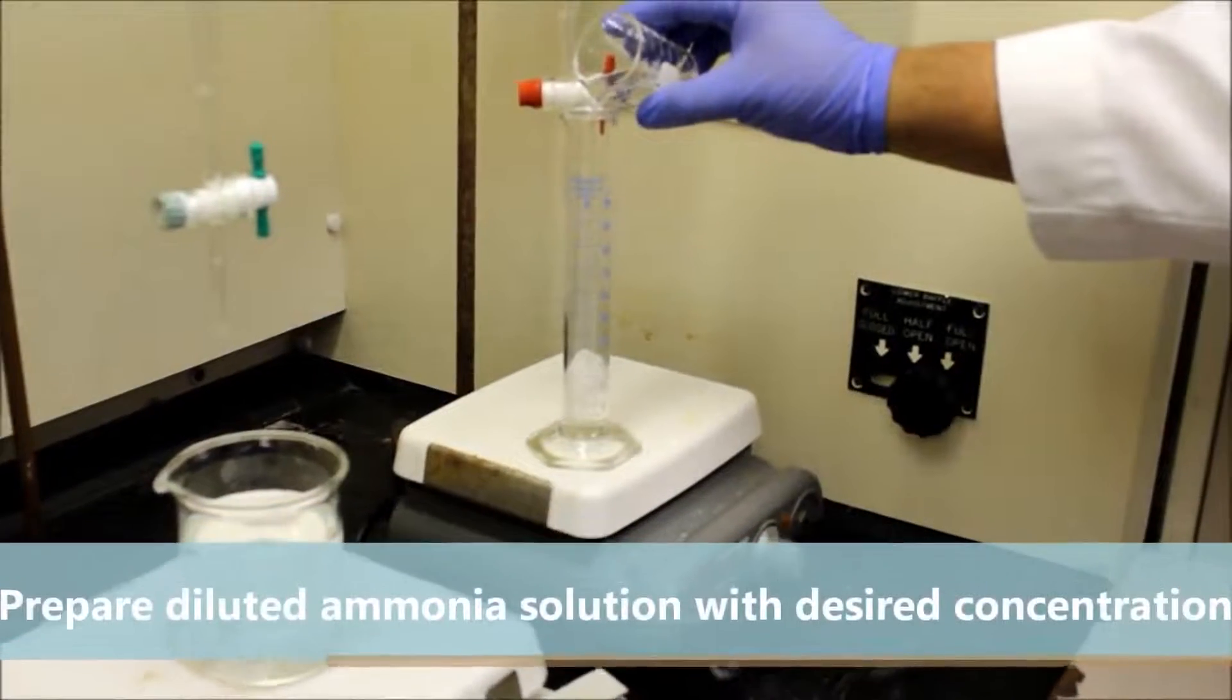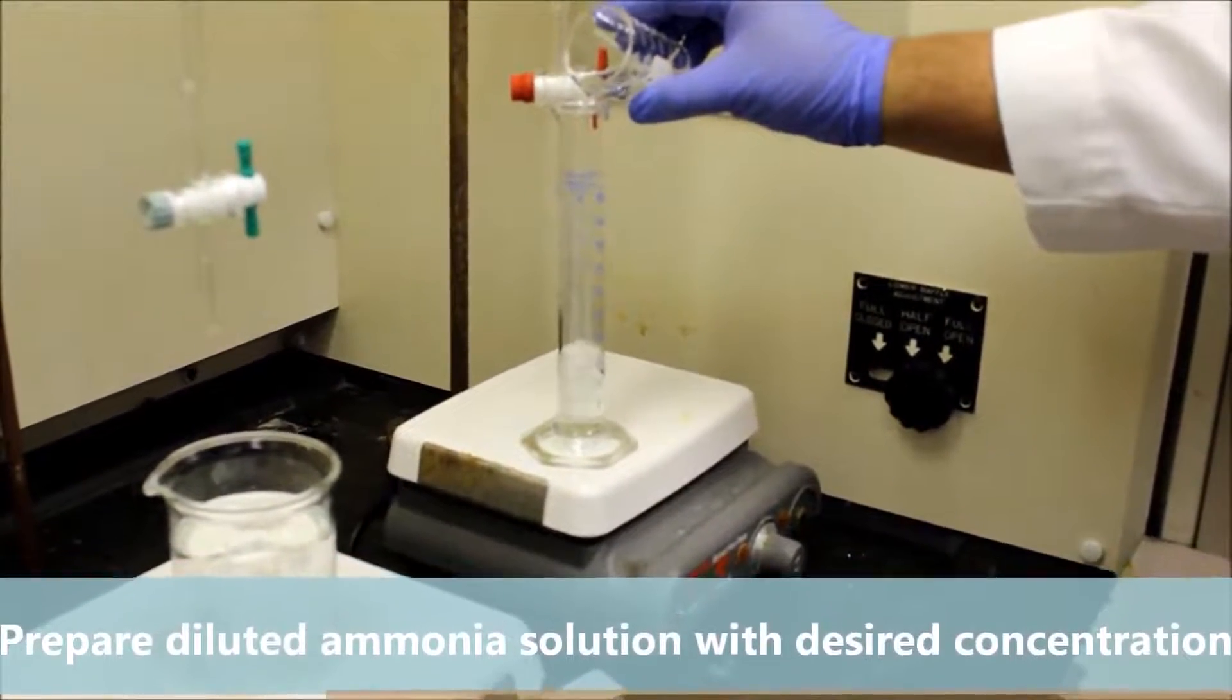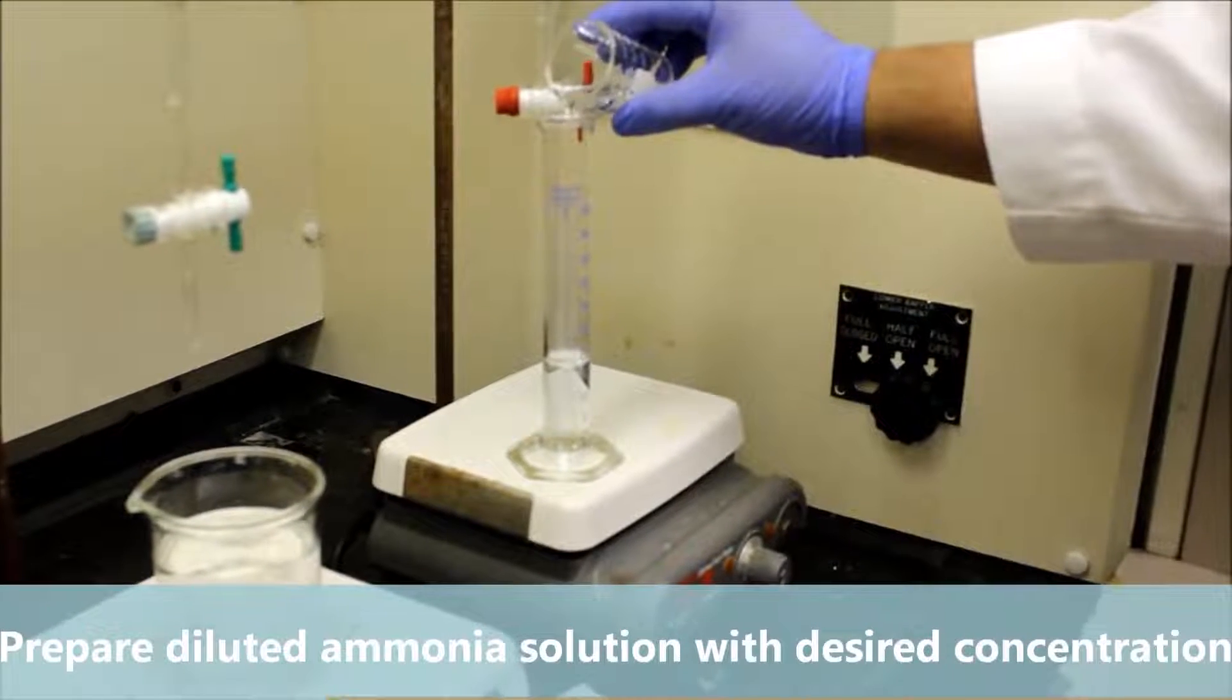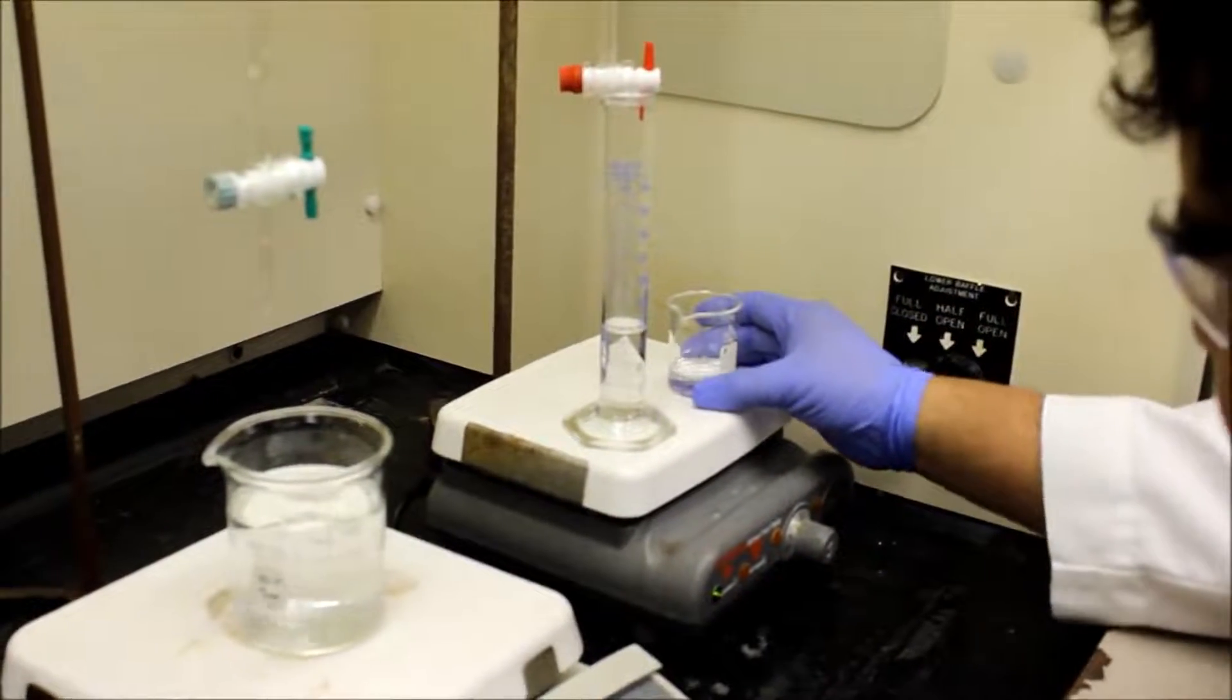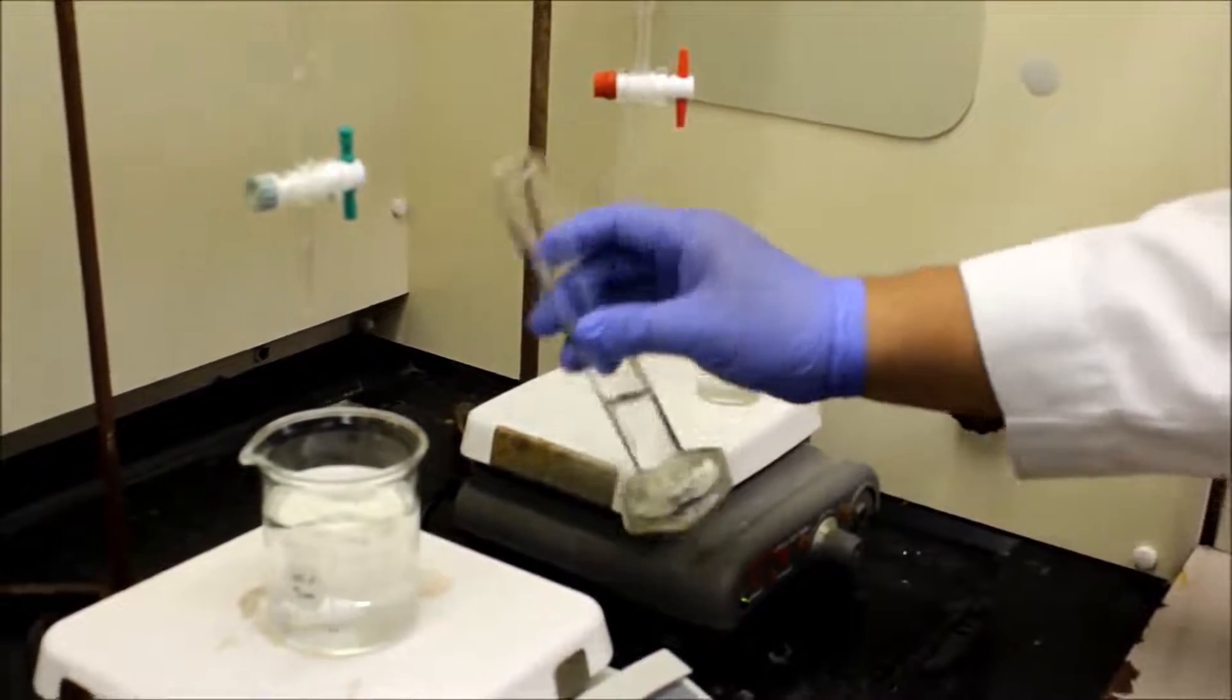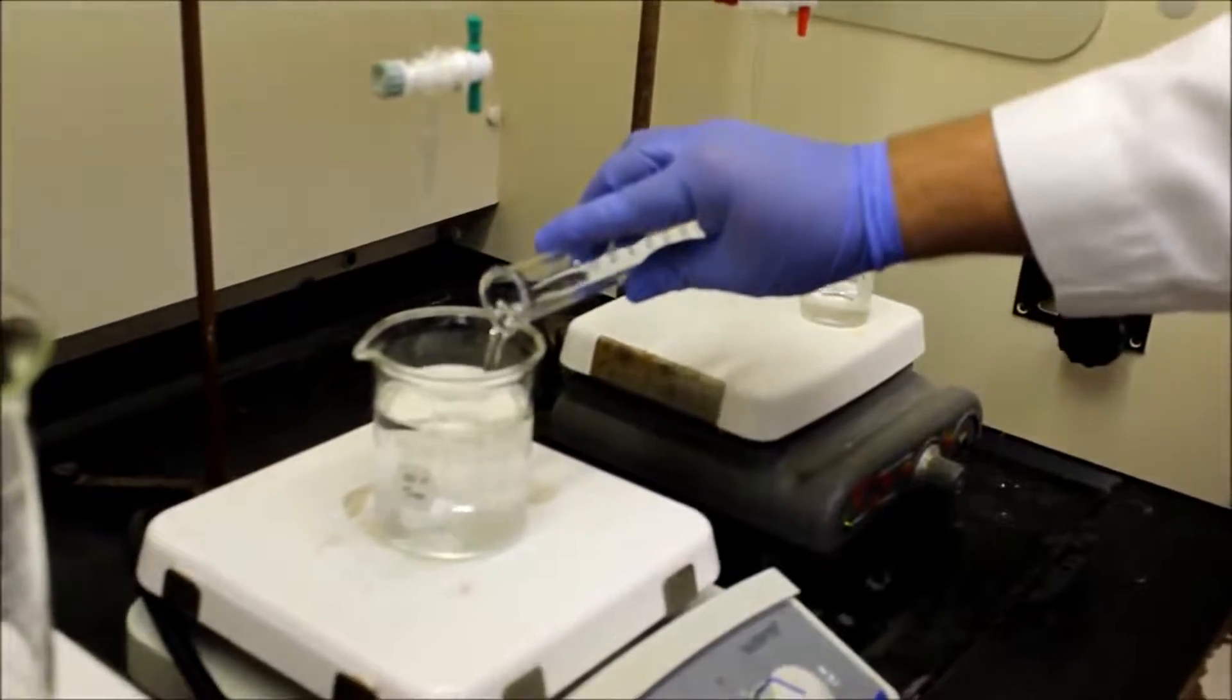Prepare different concentrations of the ammonia solution. For example, add 20 milliliters of ammonia hydroxide 30% to 180 milliliters of distilled water in a separate beaker to make a concentration of 3%.